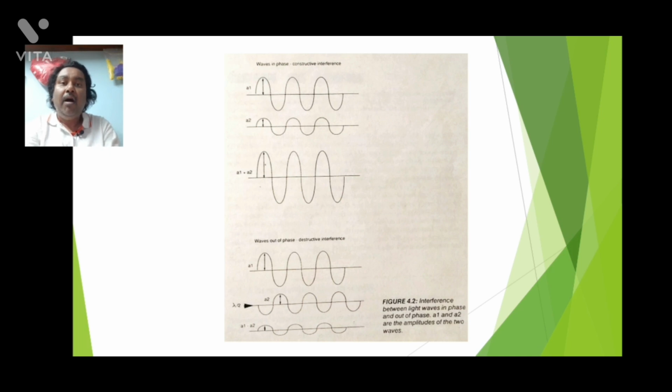The amplitude of the light wavelength determines the brightness of the light. If both light wavelengths have different amplitudes but are in phase, then positive interference will be created, and the higher amplitude will result in a brighter image and brighter light.